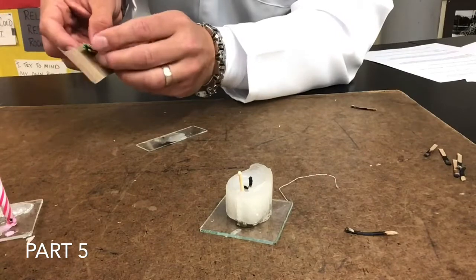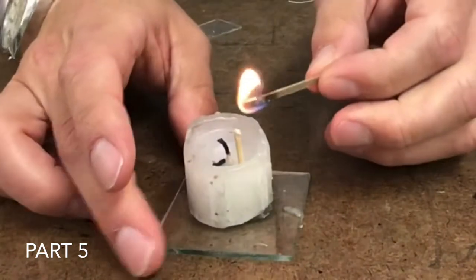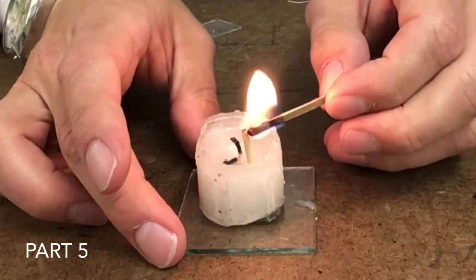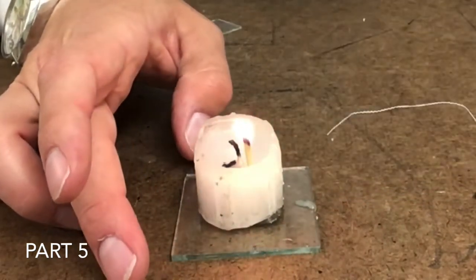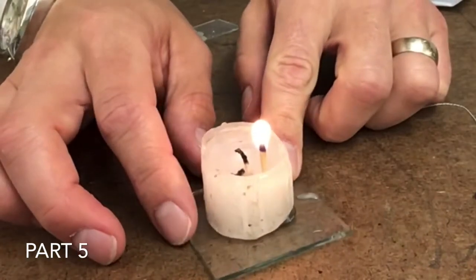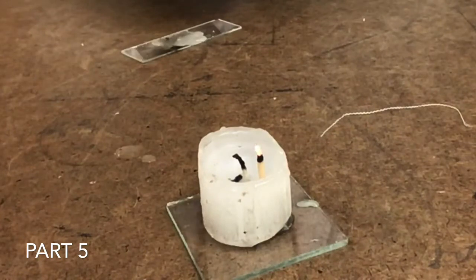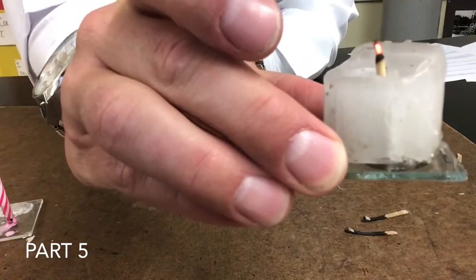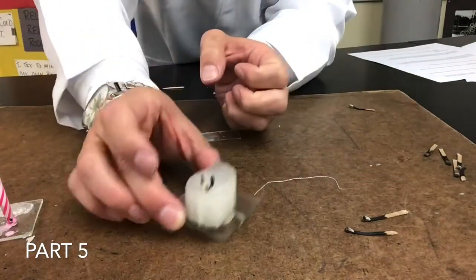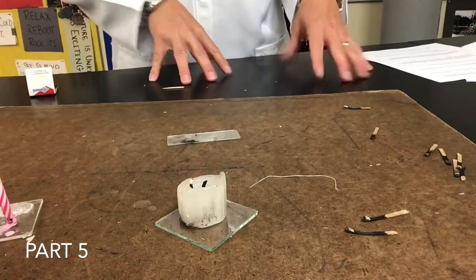So we're gonna fire up a match. Again, as always with fire, be extra safe. Let's slowly light this toothpick. And let's compare the burning toothpick wick to the traditional candle wick. And what did you notice? Looks like our toothpick wick didn't get much action. In fact, it's a little glowing ember, but unfortunately, it doesn't have that continuous flame. So for some reason, a candle likes using the traditional wick over a wooden wick.